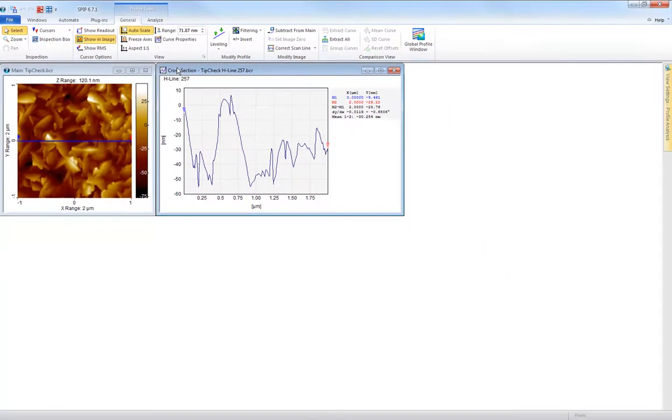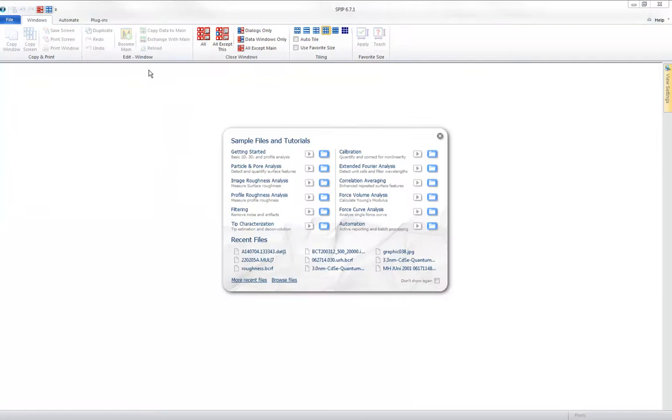When all windows are closed, only three generic tabs are left.